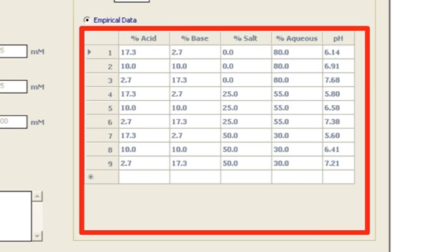We have found it convenient and sufficiently accurate to use a nine-point calibration, corresponding to low, intermediate, and high salt concentrations at low, medium, and high pH values. The empirical table gives the most accurate delivered gradient because it automatically compensates for changes due to ionic strength, as well as other variables such as temperature.